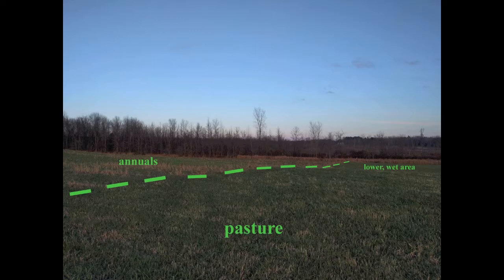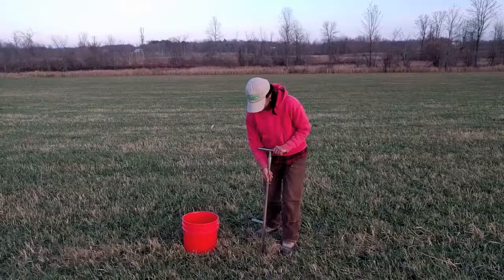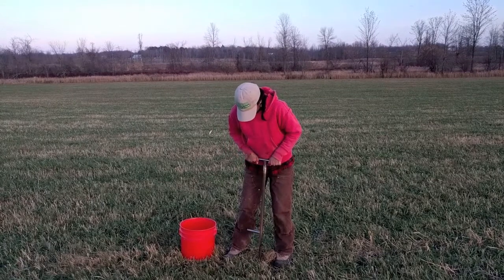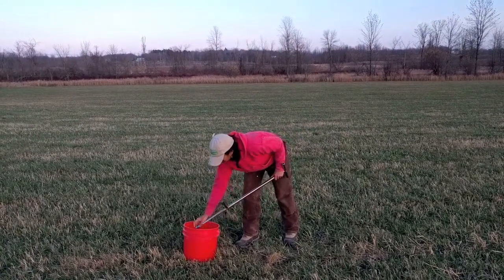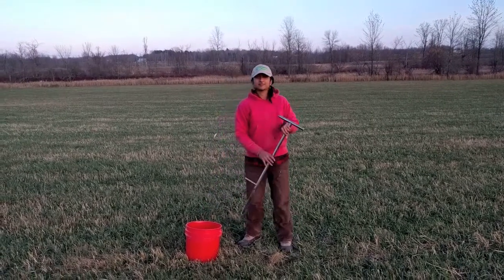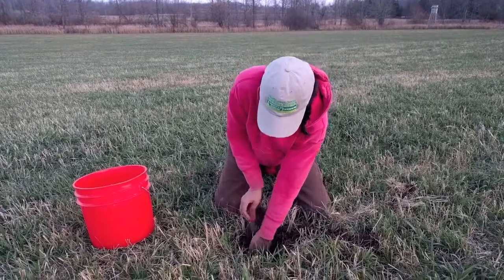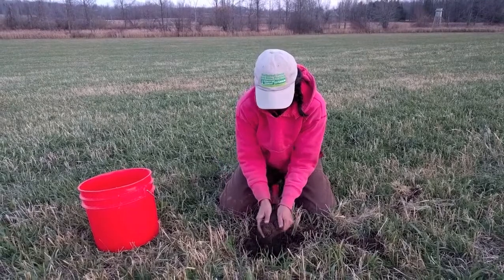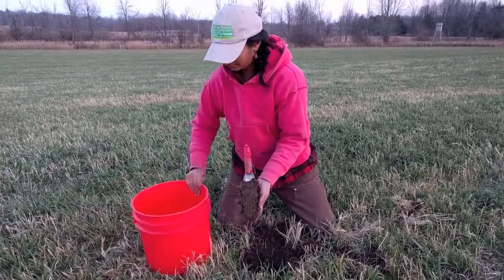To take the sample, remove debris from the surface. Push the soil probe vertically into the ground reaching a depth of about 10 inches, or the depth of your tilling zone. You can mark your soil probe with tape or a marker at 10 inches. Avoid sampling directly where fertilizer or manure was applied. Deposit the soil into the bucket. To take the sample using a trowel, dig in the ground to get to your soil sampling depth, and then take a vertical slice of the soil, trying to maintain even thickness from top to bottom.